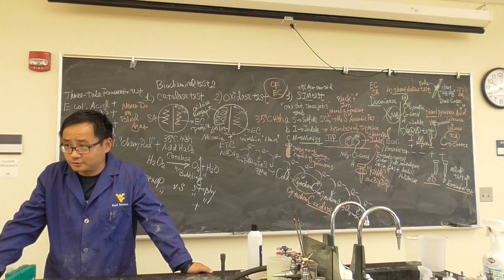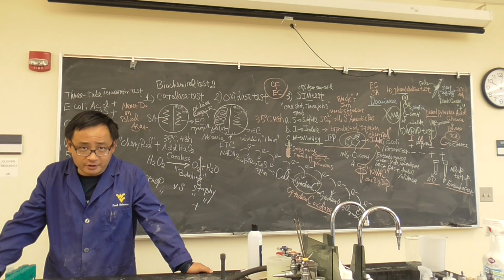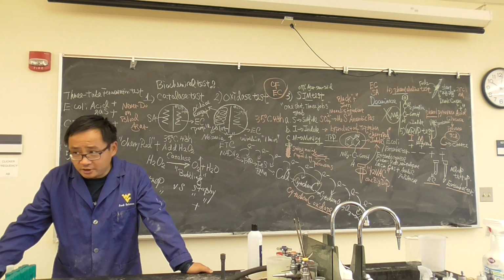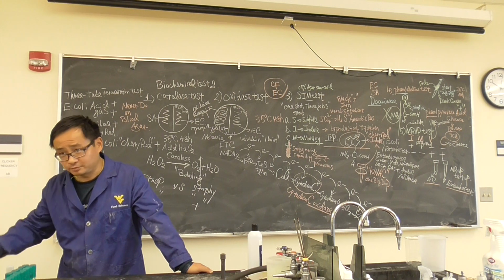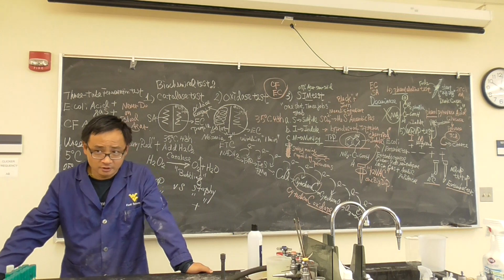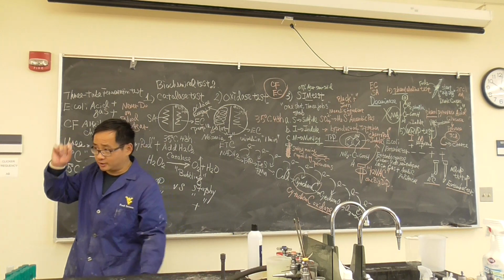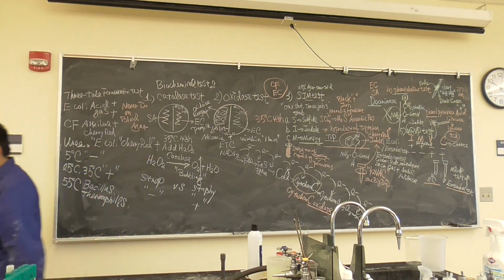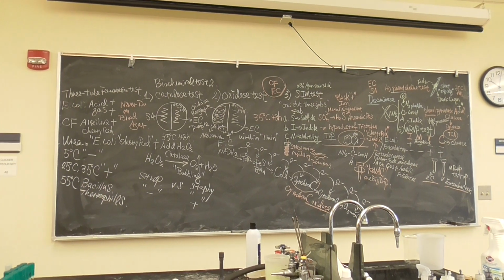I'm serious. So make sure you do a very good job of labeling. I would encourage you to label even on the edge a little bit. Put your initials on the edge, then you can find it faster. Write a star, or all kinds of triangles, to mark it yourself. Okay, so that's what we have. We have lots of work to do.